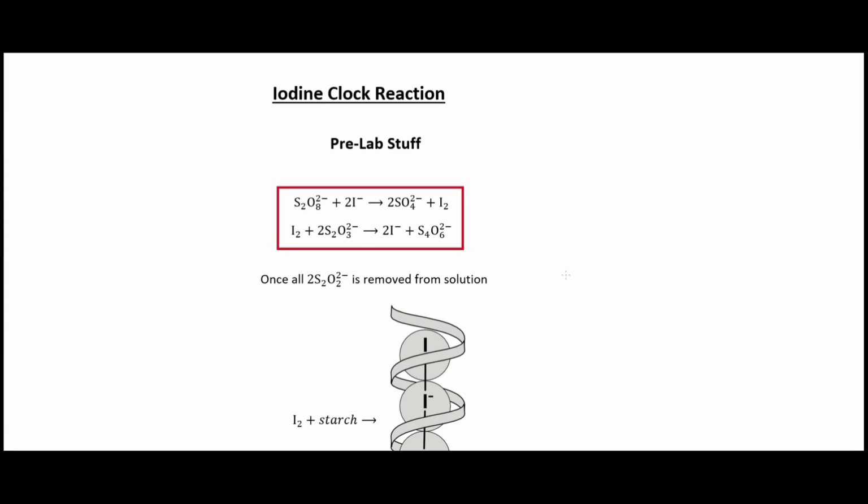In this video, I'm going to talk about the iodine clock reaction for general chemistry lab. What we're doing is looking at this first reaction we have up here. The thing that complicates this conceptually is that we are coupling it with this reaction here.